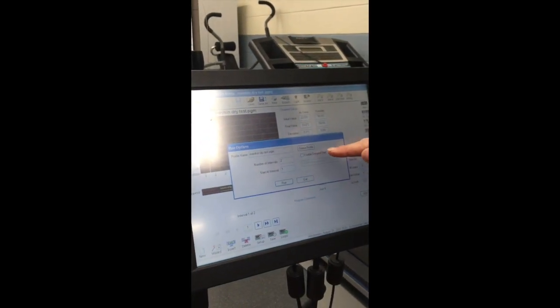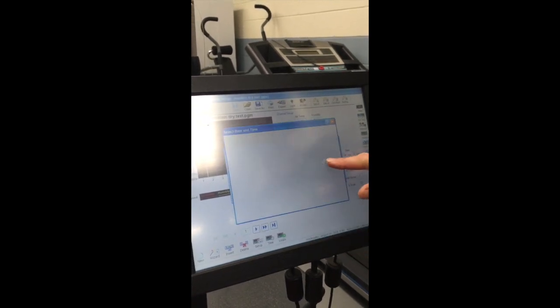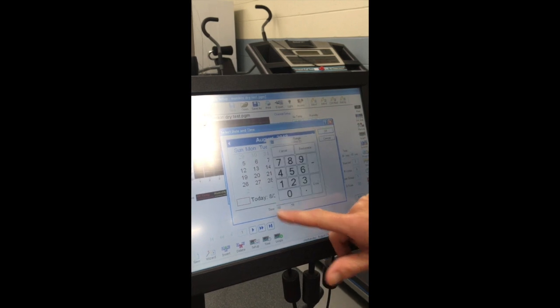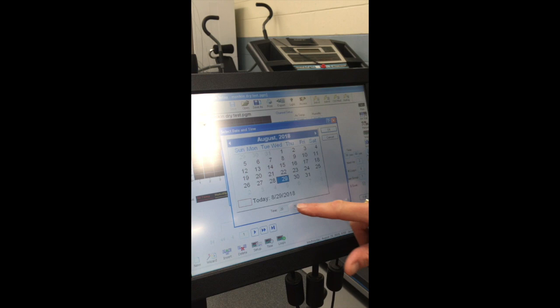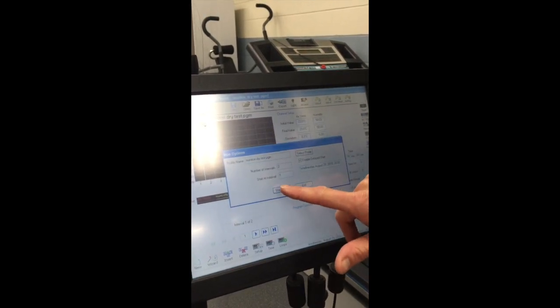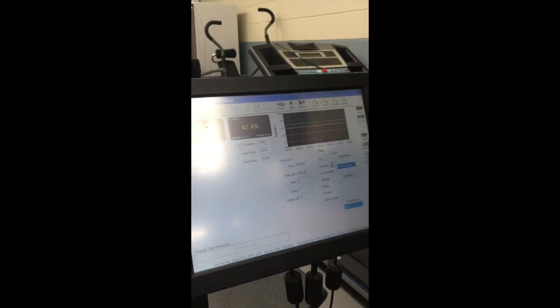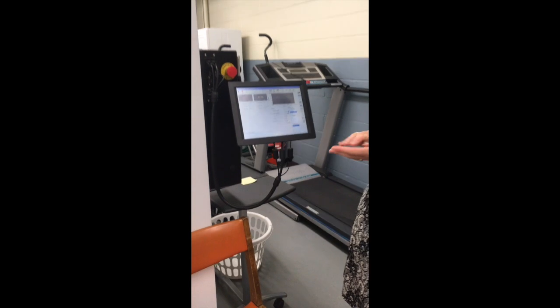and if you want it to start later in the day, you'll select delayed start, and then if you want to pick a time for the delay, we'll say we're going to start it at 20. It's on military time, and then we'll press OK and then start delay, and then the chamber will go on that evening and it will run all night, and when you get in the morning, all your materials will be conditioned.